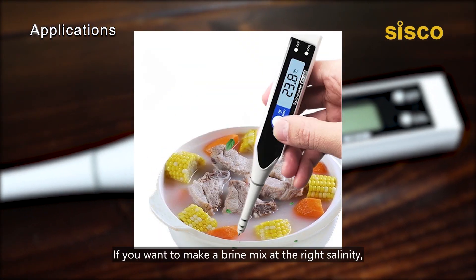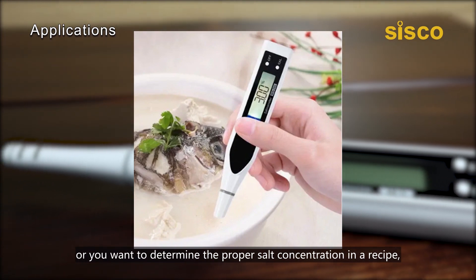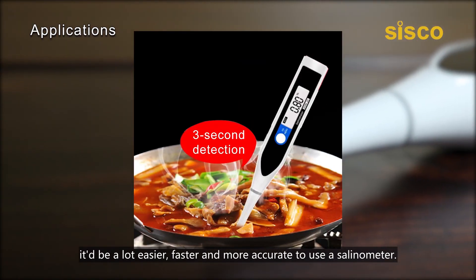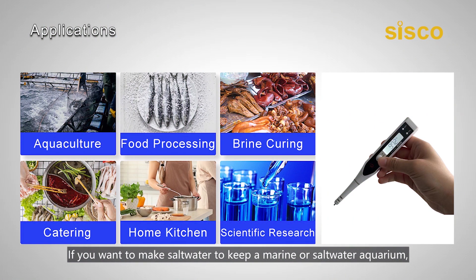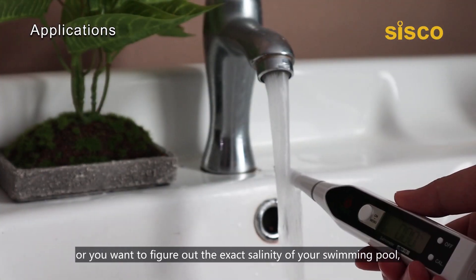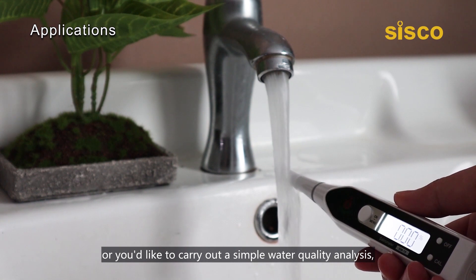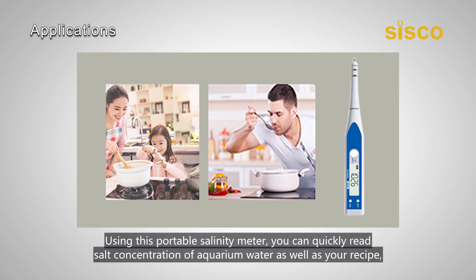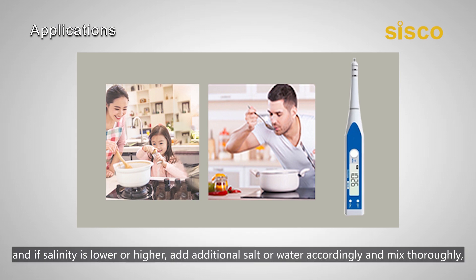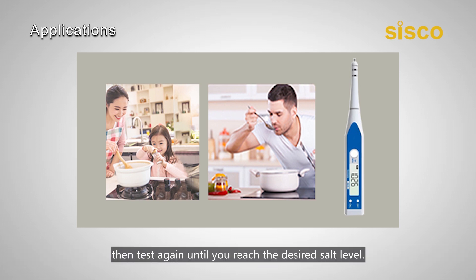If you want to make a brine mix at the right salinity, or determine the proper salt concentration in a recipe, it'd be a lot easier, faster, and more accurate to use a salinometer. If you want to make salt water to keep a marine or saltwater aquarium, or figure out the exact salinity of your swimming pool, or carry out a simple water quality analysis, the salinometer also offers a convenient and inexpensive solution. Using this portable salinity meter, you can quickly read the salt concentration of a saline water as well as your recipe, and if salinity is lower or higher, add additional salt or water accordingly and mix thoroughly, then test again until you reach the desired salt level.